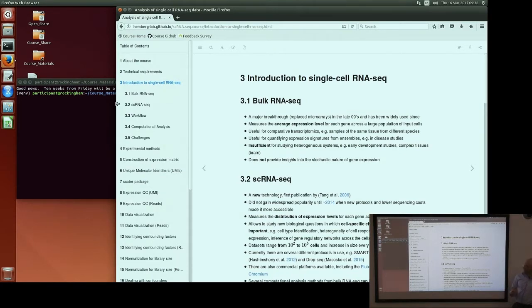Right, so first, before I talk about single-cell RNA-seq, we're talking about bulk RNA-seq, which I'm assuming that you're all familiar with now, because it's been around for almost 10 years. It's a way of quantifying gene expression in a genome-wide manner. It's safe to say that it has greatly transformed the field of genomics and transcriptomics, and that it has allowed us to get a lot of interesting data and measurements that weren't accessible before.